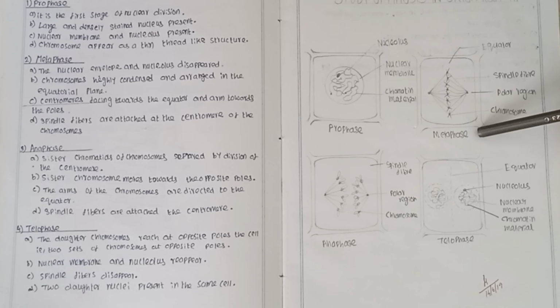The chromosomes are brought towards the equator of the cell with the help of spindle fibers.